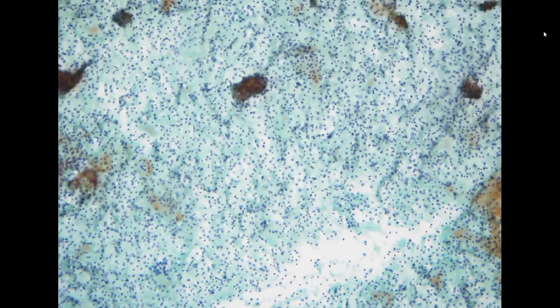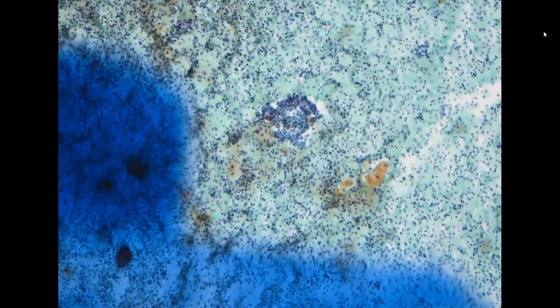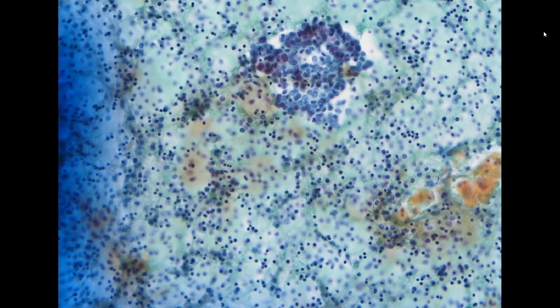So this is cytospin preparation. And in this preparation, the cytotech highlighted a couple of cells in cluster.